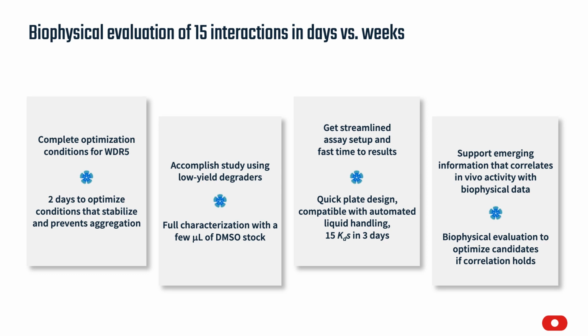Since we operated with an intelligently designed experiment, we were set up for success with high throughput to get good quality results quickly. And again, as a reminder, the results were 15 KDs after about 3 days of work. And finally, this work supports that emerging hypothesis that degradation activity in vivo can be correlated to biophysical data, which will hopefully allow for biophysical evaluation to optimize candidates before moving to cellular-based assays.